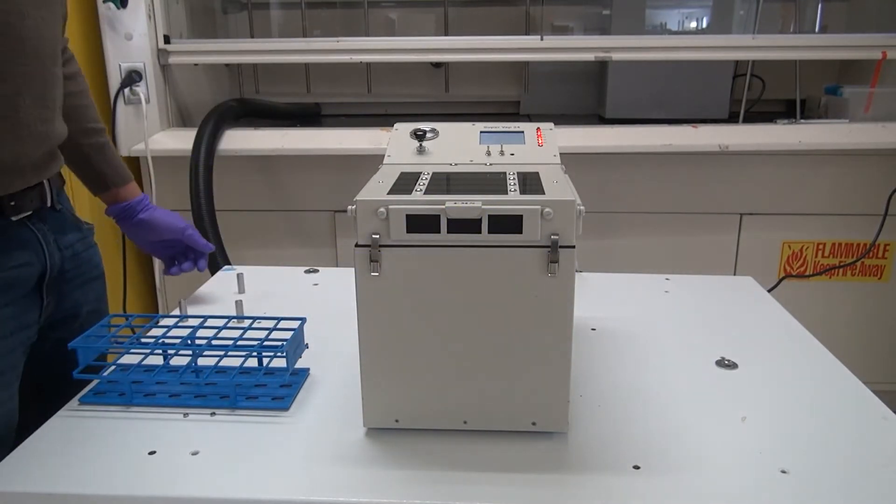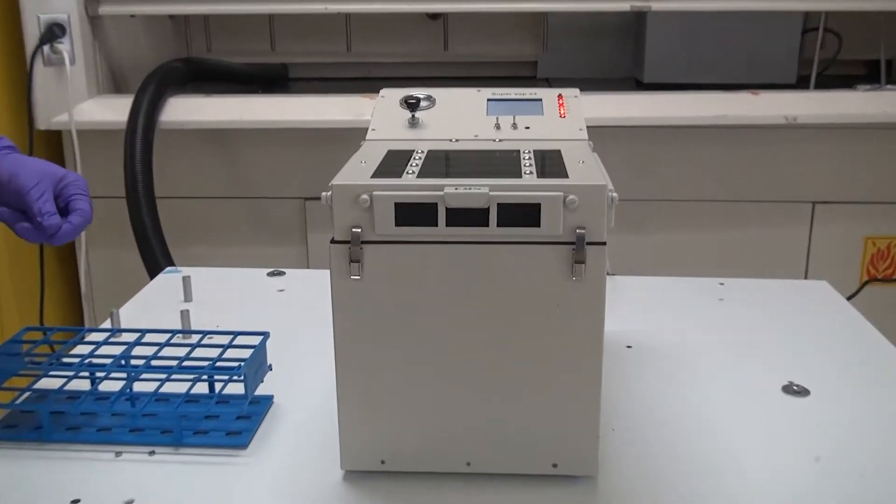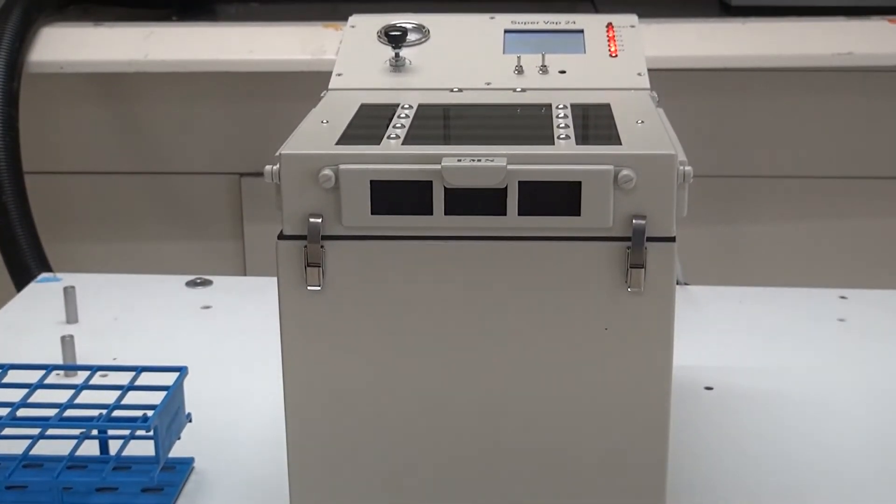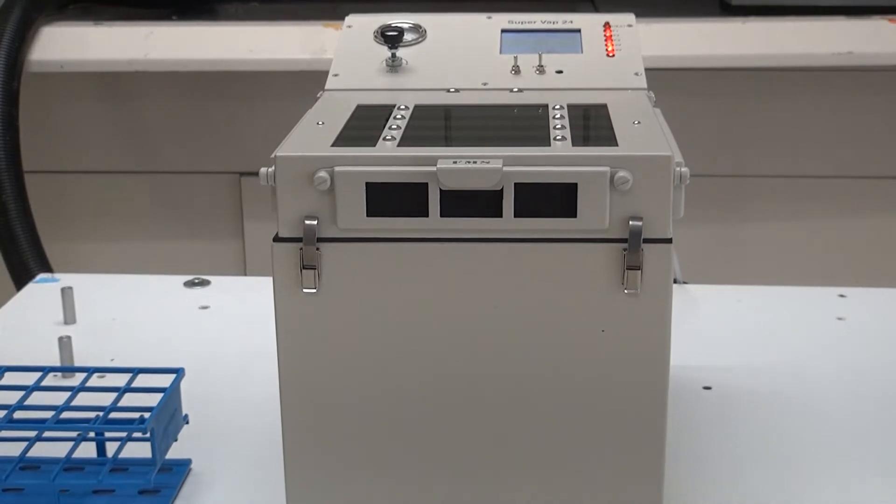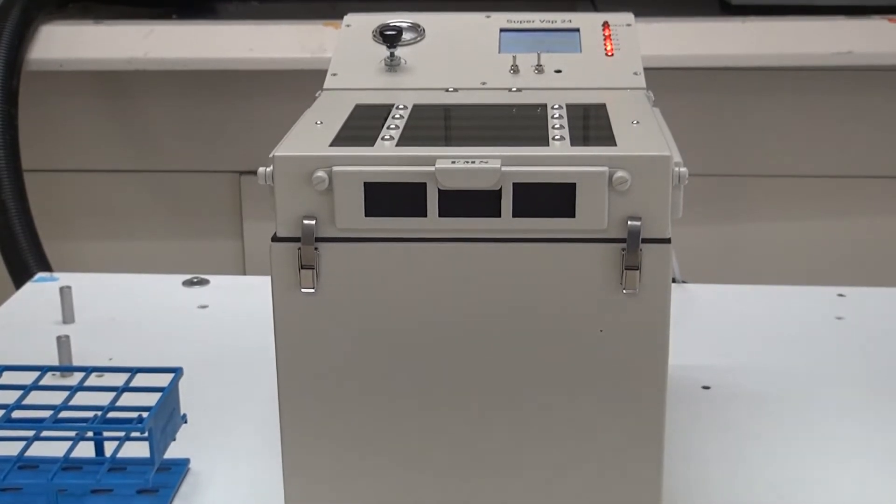It's got some HEPA filters here on the front. That's to eliminate the possibility of any contaminants from the laboratory getting into it.